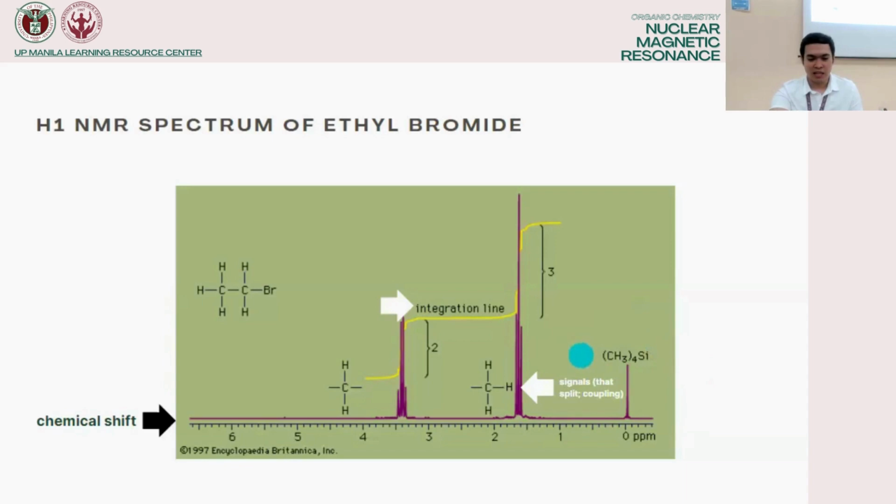Bakit hindi natin ginagamit na solvent ito? Ba't di natin ginagamit na solvent itong si tetramethylsilane? Hydrogens, correct. O, ano tong mga numbers na 2 and 3?